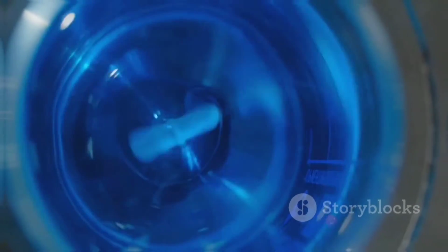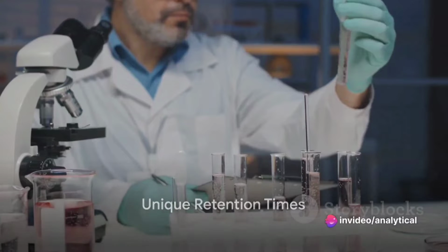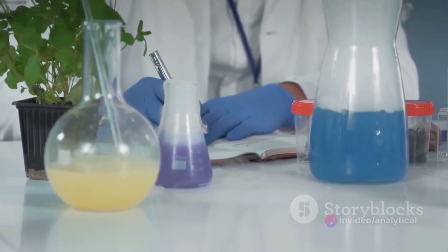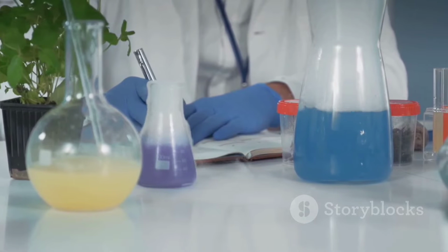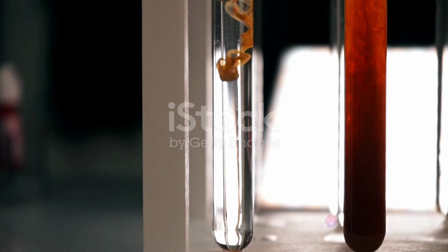the retention time. Just as every runner has a unique pace, each compound has a unique retention time, depending on how it interacts with the race track. In this case, the stationary phase in the chromatography column. Some compounds race through quickly while others take their time.